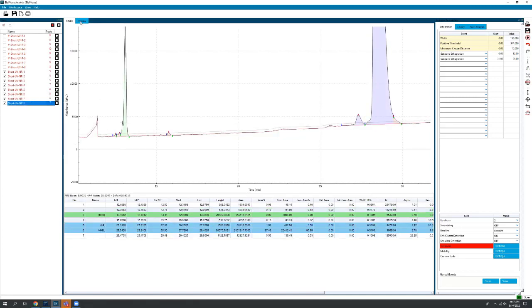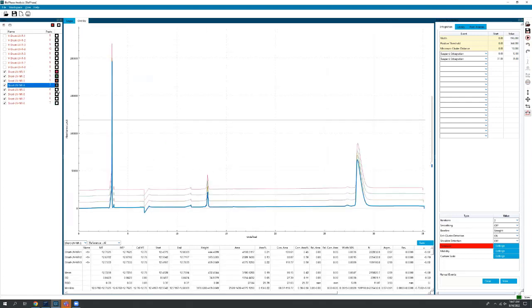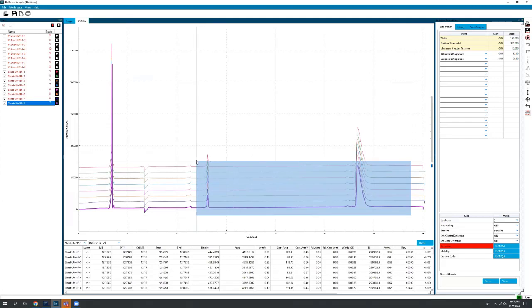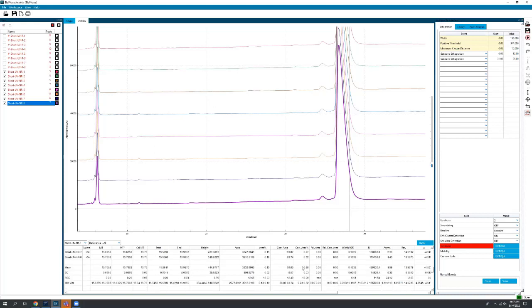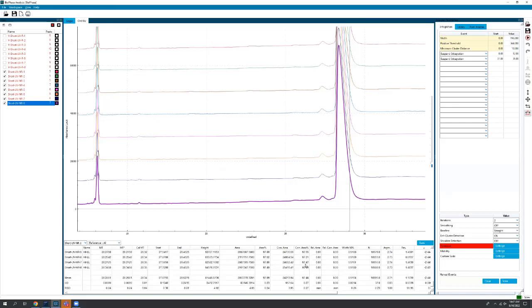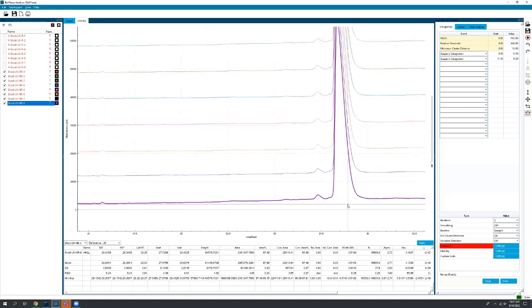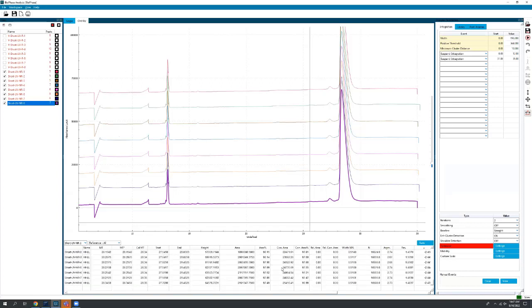and you can make adjustments as needed. Now, if we look at the overlay, because again, what really matters is that we're getting the same, whoops, I have to add them to our overlay here. What really matters with this assay is ensuring we're getting that robust result, right? That we're making sure everything looks the same across all our capillaries, that we're getting what we're used to seeing. If we look at corrected area percent for the main peak, it's about 97.5%. Pretty tight range there, even without really going through and making sure all of our peaks are integrated exactly the same.